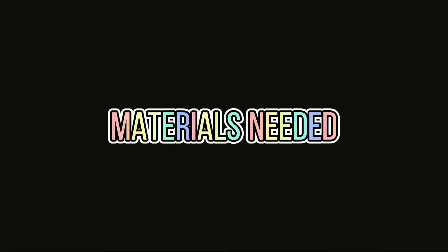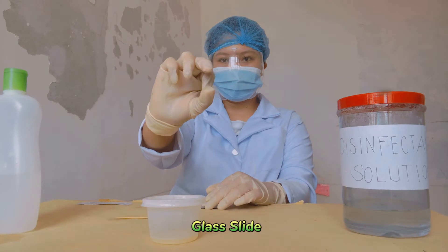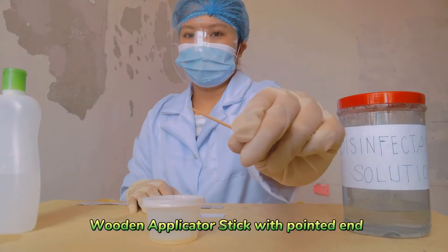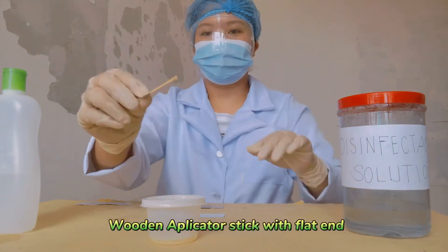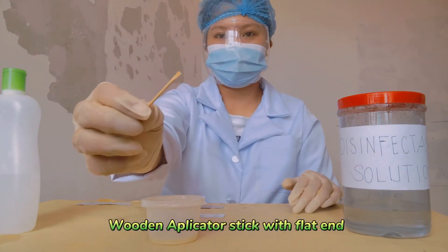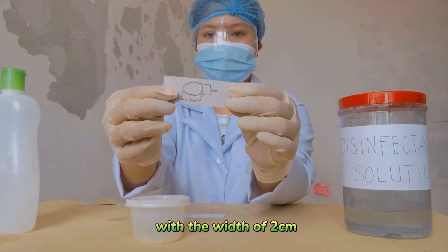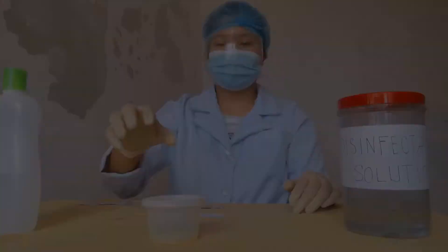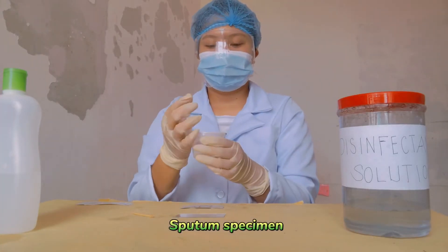Materials needed: glass slide, wooden applicator stick with pointed end, wooden applicator stick with flat end, template of smear with a width of 2 cm and 3 cm length, and sputum specimen.